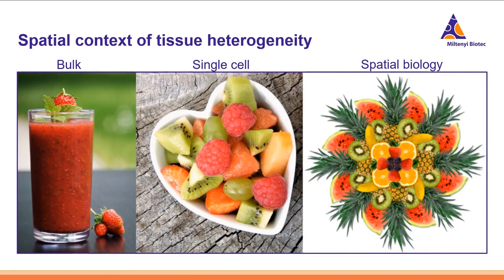we understand from this. And that's where, when we started moving into the single cell analysis, thinking also single cell sequencing, the really great thing about this technique was that it gave the ability to really appreciate the heterogeneity in there. We were able to break it down and see these individual components, start seeing rare populations, being able to see those different fruits or even the different phenotypes that would be in that tumor microenvironment.